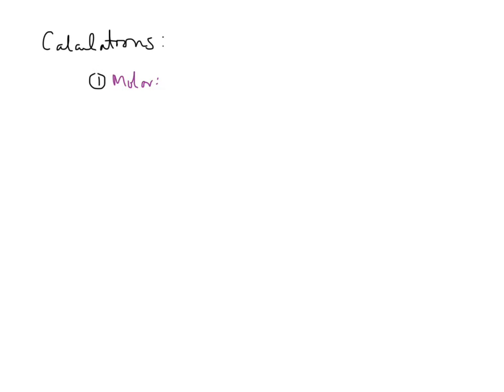Then your unknowns, you can see that you have a little table that goes with those. Right here it says that for your 4 trials, for your 4 unknowns, in each of them you're going to put 5 mils of this. This is your weak iron. 5 mils of this in each of those. The middle column says 2 mils of this one, this is going to vary.